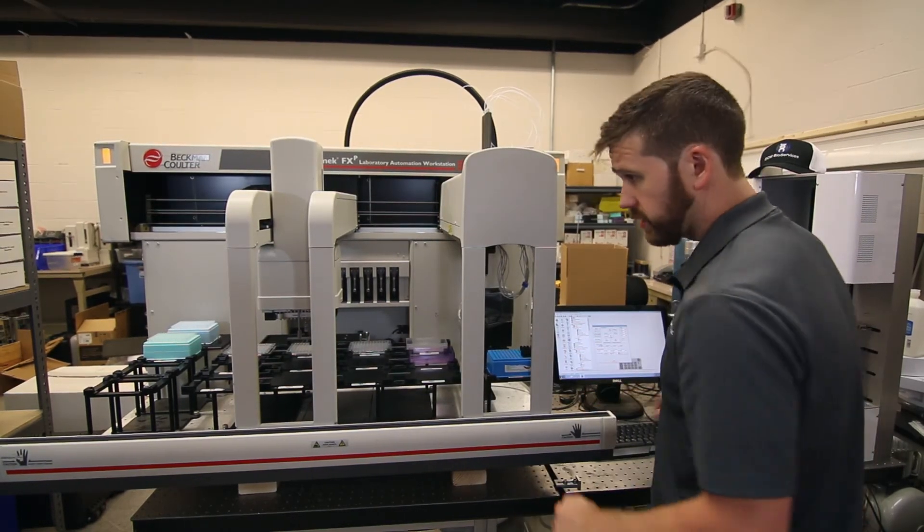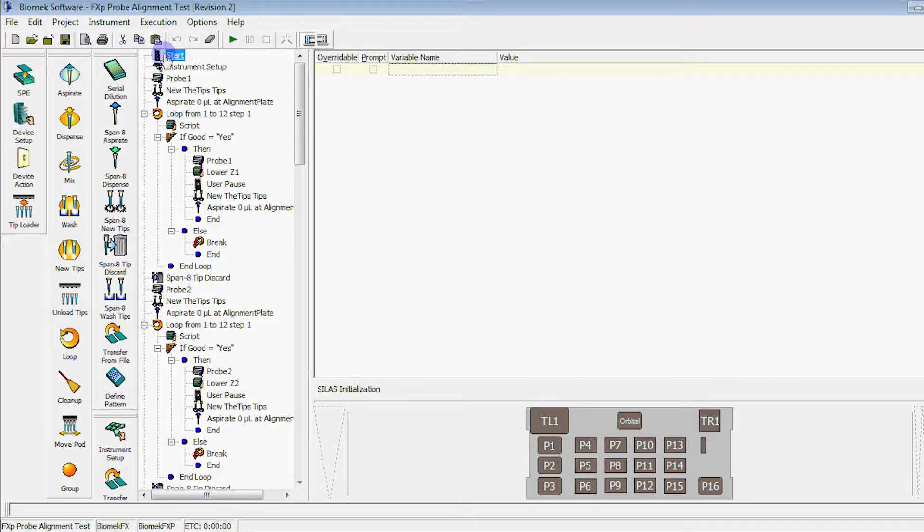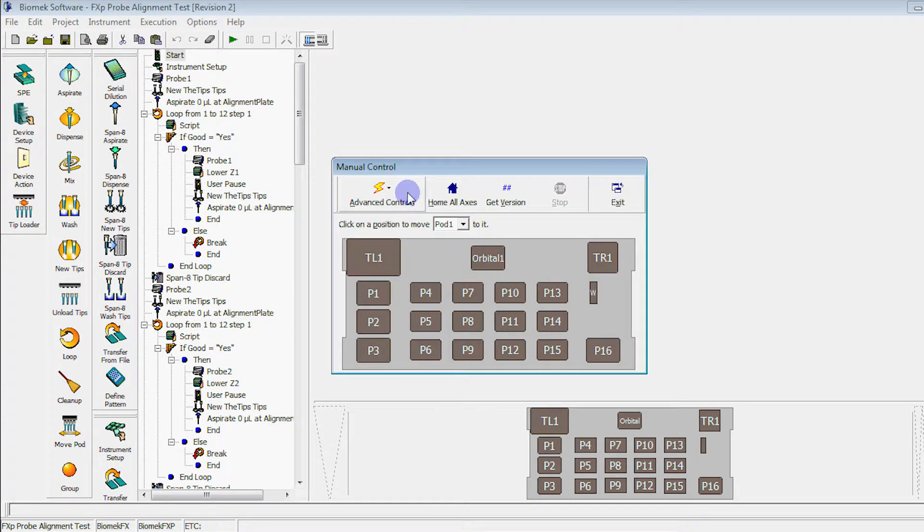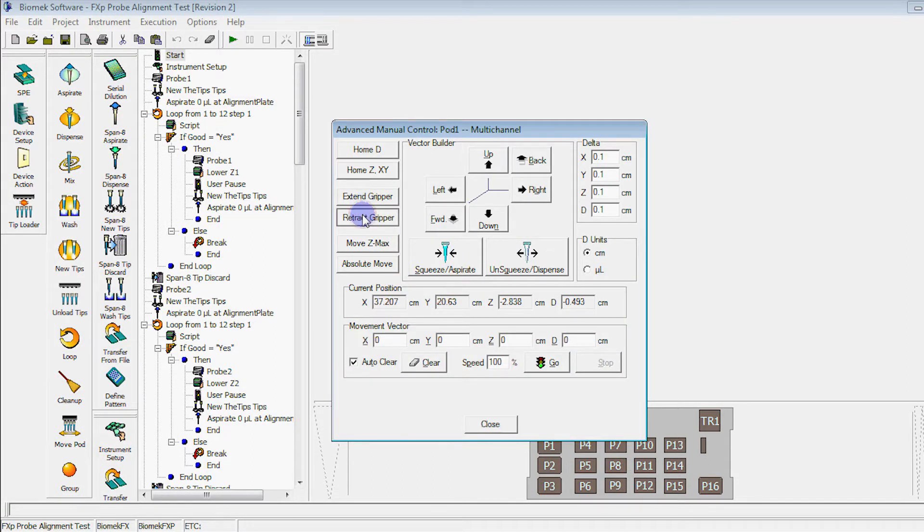Once your new grippers are installed, go back to your software and before doing anything else, retract your grippers. Go to Instrument, Manual Control, select your multi-channel pod, and select Retract Grippers.